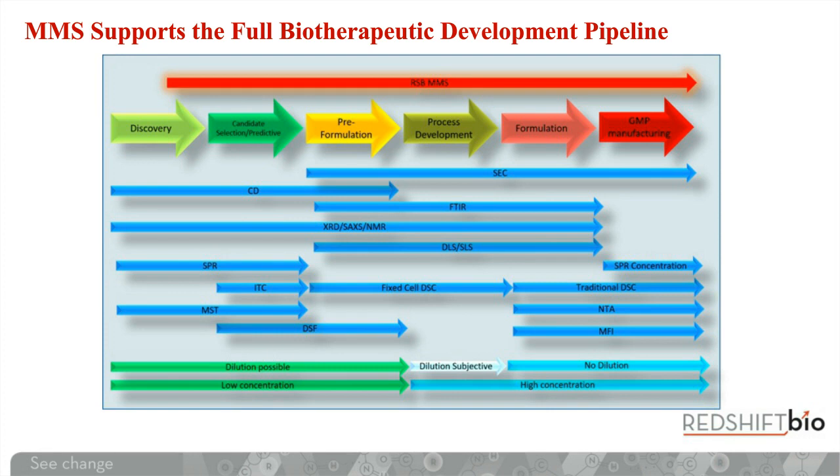Normally, we do have techniques that fit one or another of these stages, but we would normally have to infer data between these different techniques. And of course, as I described a few minutes before, a number of these different techniques have their own caveats, and so this can really complicate these types of comparisons. MMS here will give you a direct comparison using the same data and the same outputs between very, very different samples.